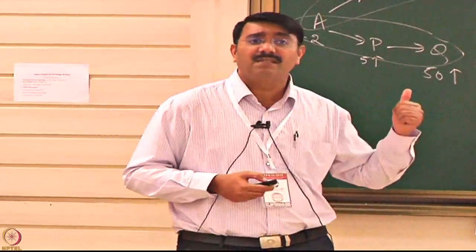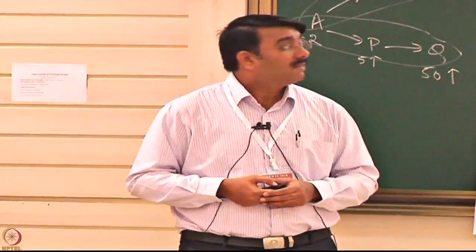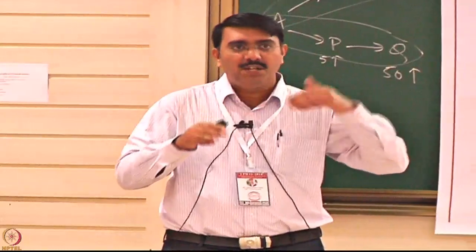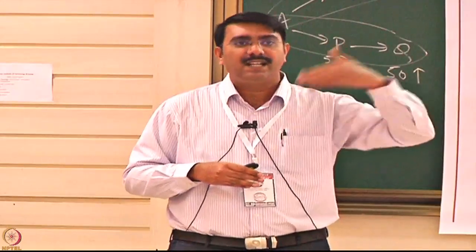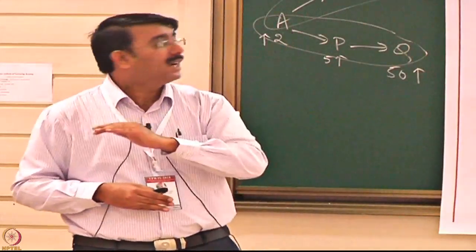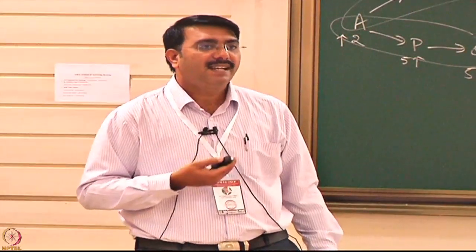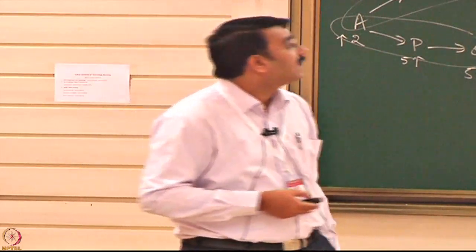But when it comes to the BLI technology, there is more advantage. I will discuss that. And apart from that, SPR has low throughput. In SPR techniques, you have a channel, and you have to inject one concentration after the other, serial dilutions, over the surface. But the BLI technology is very high throughput. That's where the limitations come in. When you are deciding the right candidate in screening experiments, BLI has more advantage.